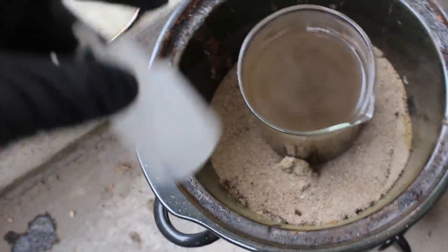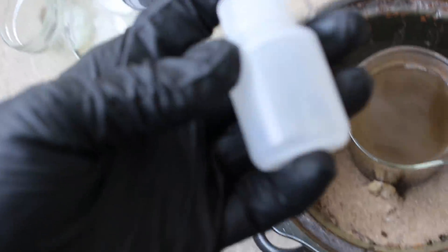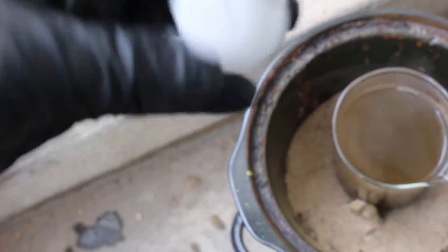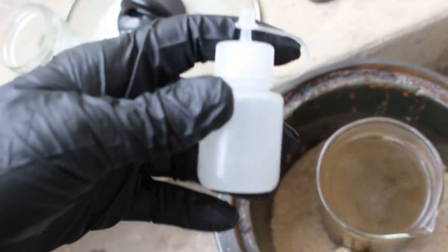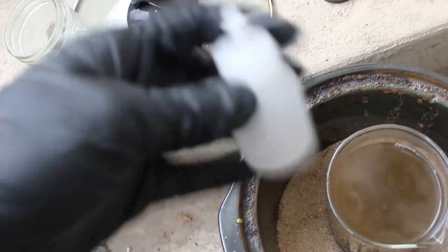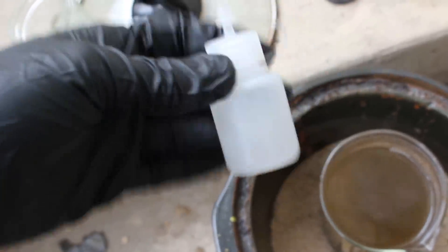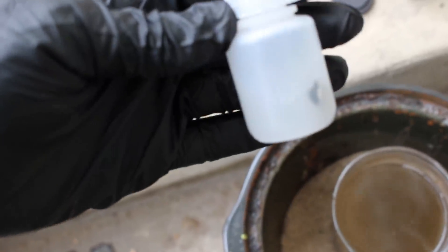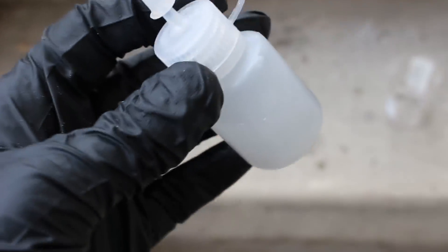Once it settles out, I'm going to check it with stannous chloride to make sure I got all the gold out. I took a piece of tin metal and put it inside a bottle of hydrochloric acid, and let it sit for a few days. The hydrochloric acid dissolves the tin into solution, giving me a solution of acidic stannous chloride, which is exactly what you want for testing for precious metals in solution.